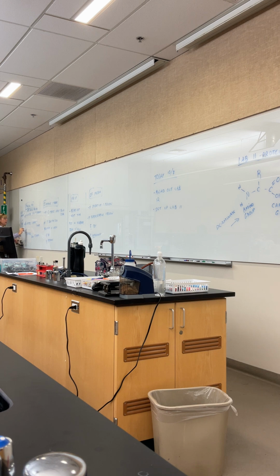Did any of our organisms turn the media a yellow color? Yes. Good. So which organism turned the media bright yellow? E. coli. Good. So what that means then is E. coli is going to be the organism that is positive for breaking glucose down.